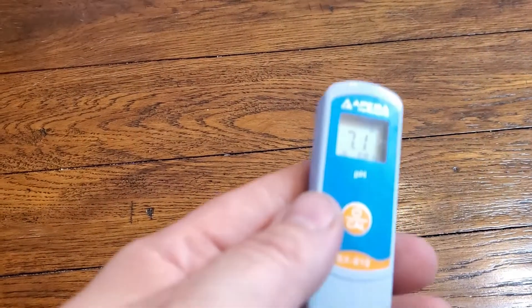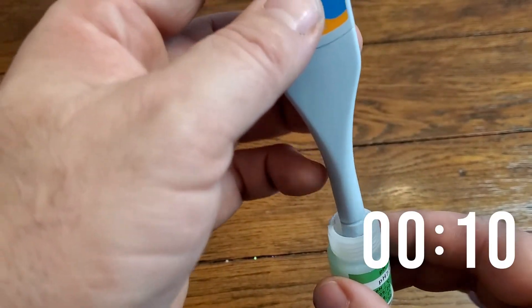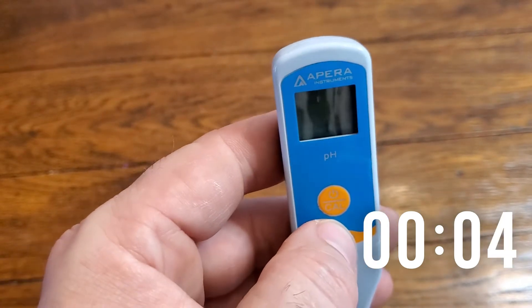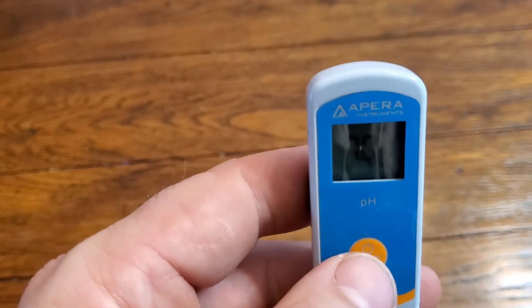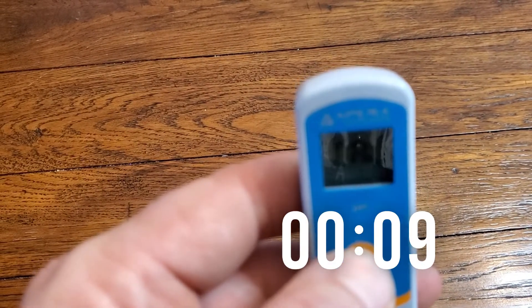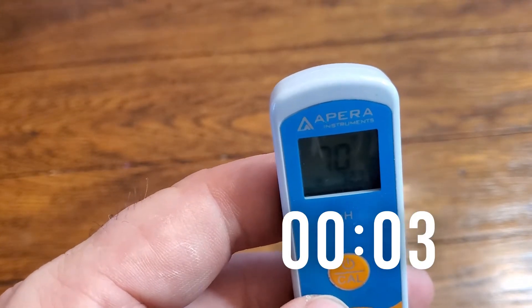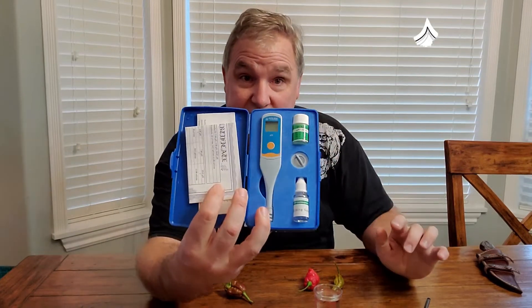I'm going to do it again so you can see it from beginning to end. I put it in the solution, hold the button, and it says 'calibrate 7.0 end.' Let's try one more time — I press calibrate, release, it flashes 7.0, recognizes it, and says 'end.' It's calibrated. That's it. It took me less than 15 seconds to calibrate my meter.